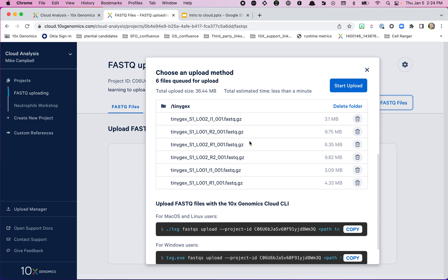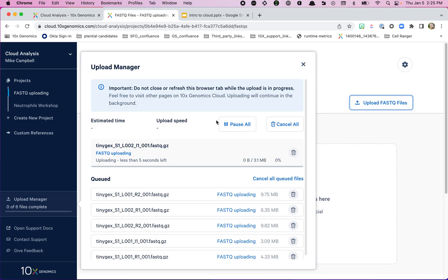I've got two sets of FASTQ files here. They come in groups of three: I1, R1, and R2 — an index read, read one, and read two from our sequencing machine. If you look through these you can see there are two different lanes — lane one and lane two. They're a little out of order here, but that's not a big deal because our Cloud platform is going to sort these into the correct order and group them. I'm going to hit Start Upload.